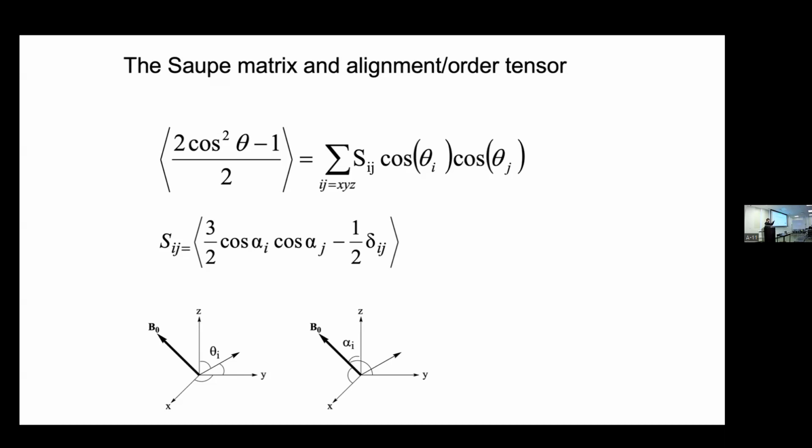But imagine I take this and I start doing this, to be annoying. Now, what used to be the direction of order is the one that's most dynamic. And the most ordered direction is the one perpendicular to it, right? If you sat on this vector, you'd experience nothing. You'd be like, hey, I'm always perpendicular to the field. This direction is always perpendicular and it's not averaging out. Everyone else is getting averaged out. So this would become the new direction of order, except the vector is perpendicular to the field.